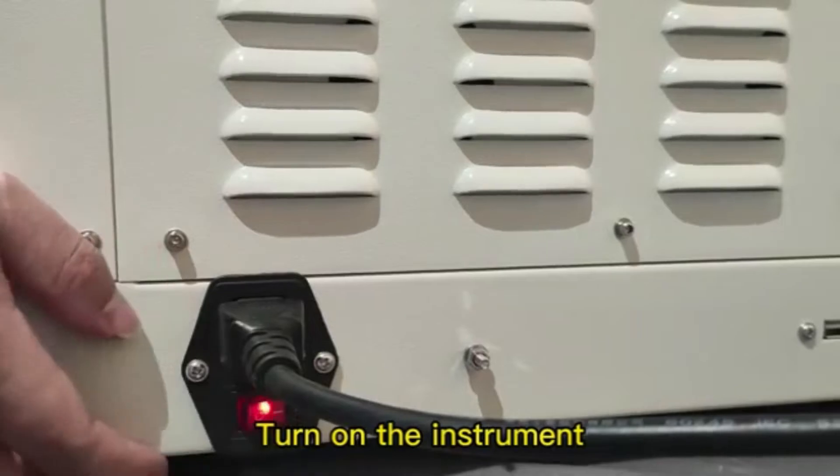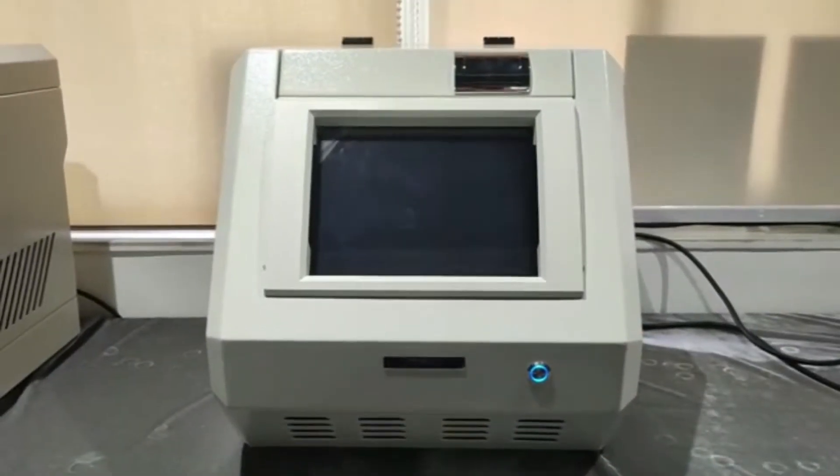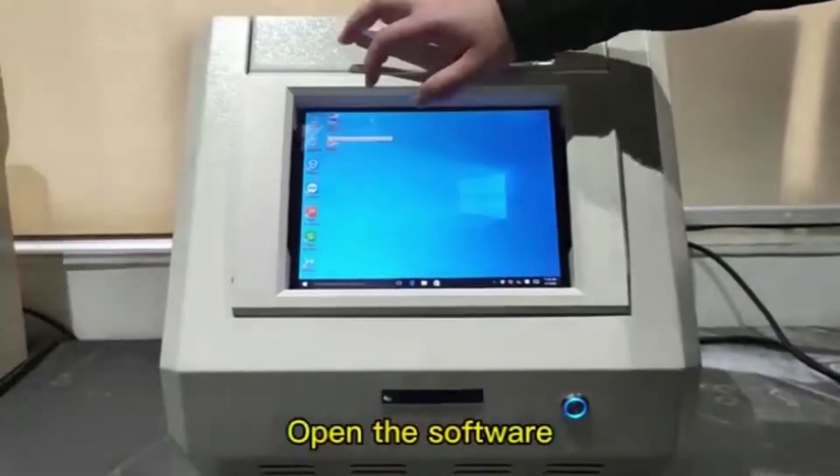Turn on the instrument. Turn on the computer. Open the software.